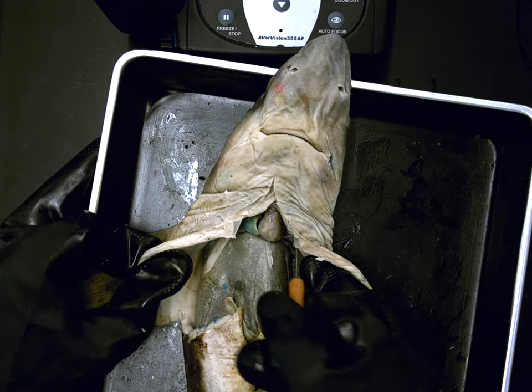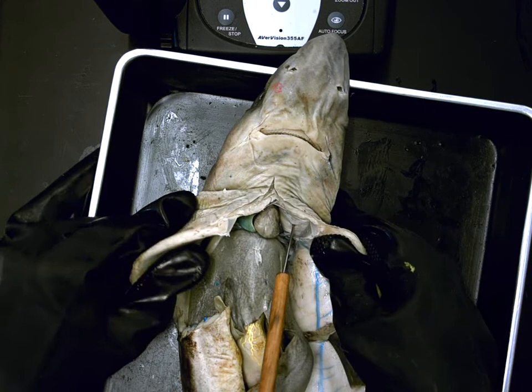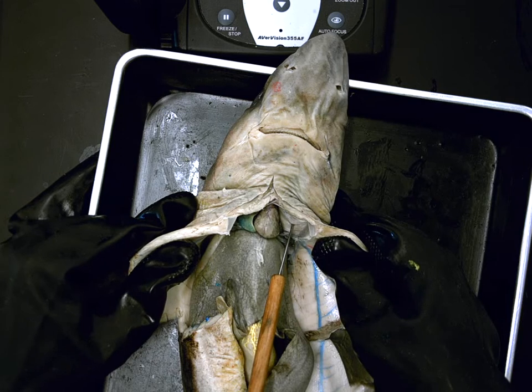If I were to pin in here, Rachel, and I asked what is the space where the pin is currently found? The pericardial cavity. Excellent. Function of the pericardial cavity is? It creates room for the heart to beat.